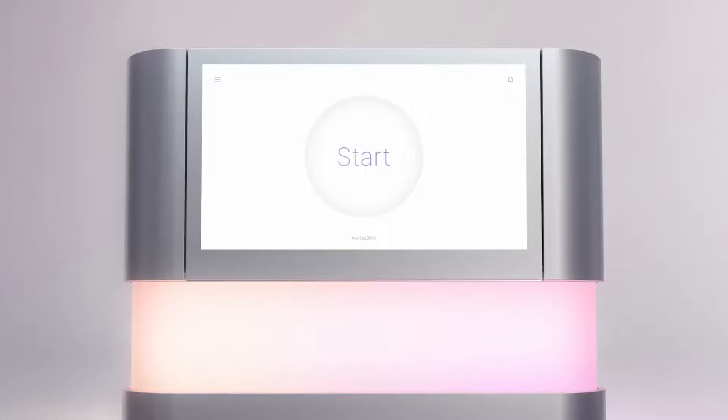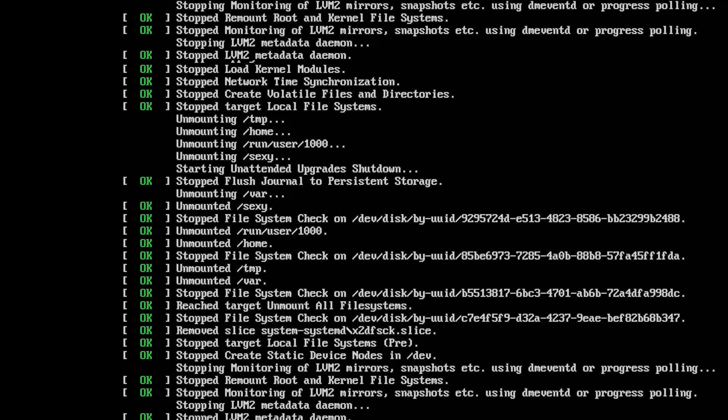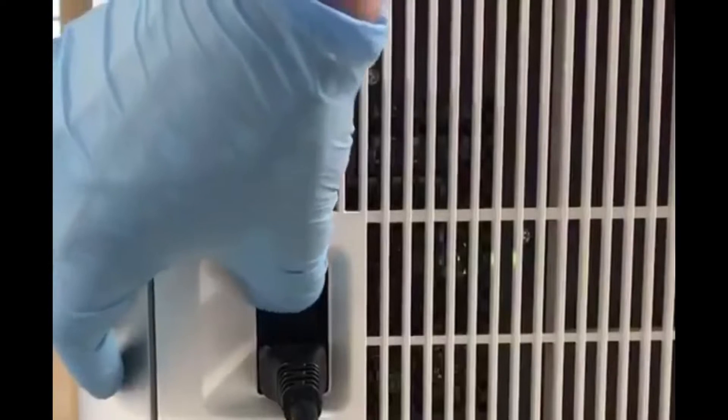When the scripts on the screen complete and the screen is blank, reach to the back side of the instrument and press the power off side of the toggle switch.